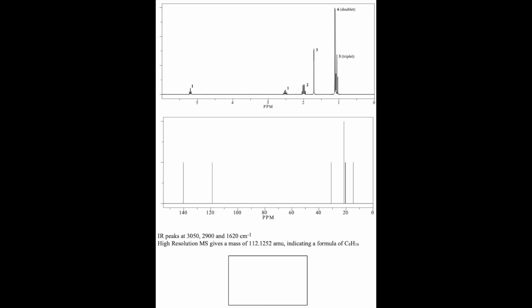So that's useful information. Next, I'm going to look for interesting carbons with respect to chemical shifts. In this case, I see 2, and they're in the pi region, above 100. And they're in the lower end of the pi region. Again, don't just look at it as, they're far to the left. They're actually in the lower half of the pi region. And those are indicative, again, of either carbons that are in an alkene or a benzene. But now I can see it's an alkene.